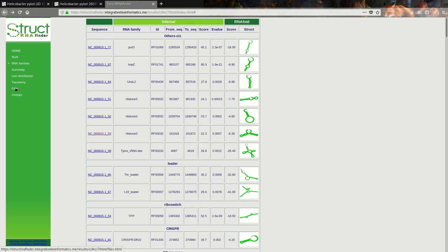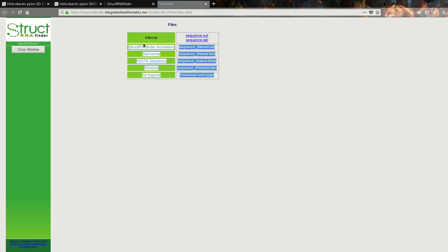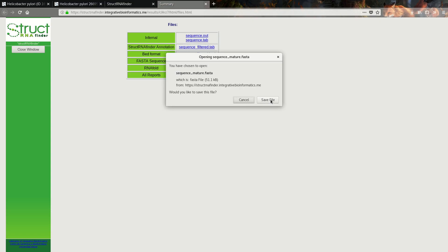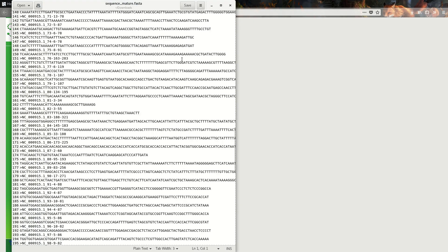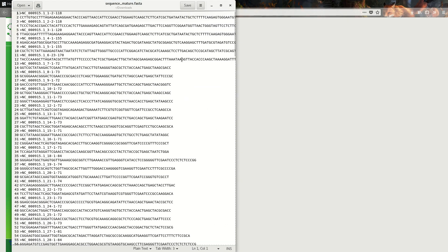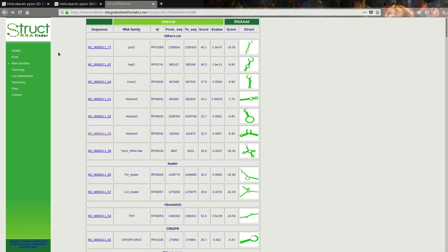Lastly we have the files. In this file section we can see all the intermediate files used in the background programs. If you want the FASTA sequences for all sequences found as RNA sequences, we can save it and open it to see all the RNA files with their sequences. That was it for StructRNA Finder, I hope this was helpful.